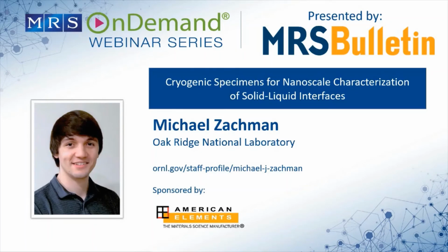There's questions come in about some of the results that you're actually showing, specifically, are the black spots in the SEI evidence of porosity in the SEI, or are they artifacts associated with the preparation? Yes, that's a good question. Those are very significantly different from any of the little bubbles that we get from either preparation or exposure to the beam. So what we think is that those are actually bubbles in the SEI.